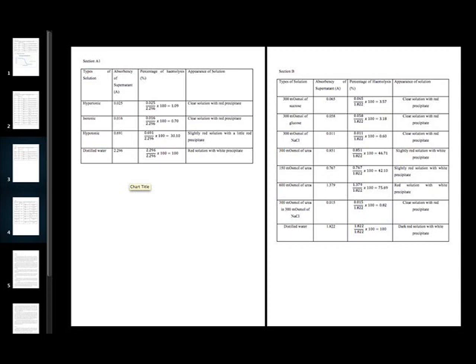For 300 milliosmol, 600 milliosmol, and 150 milliosmol of urea, the percentage of hemolysis is high. 150 milliosmol urea is hypoosmotic to erythrocyte, whereas 600 milliosmol urea is hyperosmotic to erythrocyte. It can be deduced that urea is penetrating and has no effect on tonicity. The 300 milliosmol and 150 milliosmol urea are hypotonic to the red blood cell, which subsequently causes influx of water into the cell and swelling of the cell. Hemoglobin is lost to the surrounding solution, giving the supernatant a red color. For 600 milliosmol urea, it seems that it behaves more like a positive control.